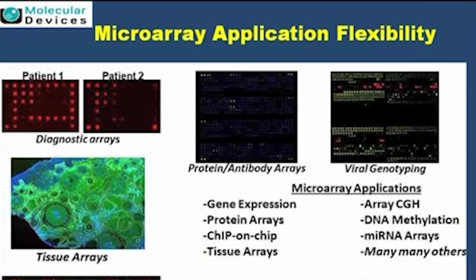And the protein arrays are now really catching up in many senses, because the protein is actually the biological function, what many scientists believe, and I am also a strong believer. So now people are moving from the DNA to the real functional part, how they are directly affected. The major bottleneck was looking at the antigen antibody reactions, like the proteins are all being seen. There is no general formula, but now the field is catching up. So even at the level of protein arrays, this is compatible. The incoming tissue array, which is really in infancy, is also now compatible with GenePix Pro.